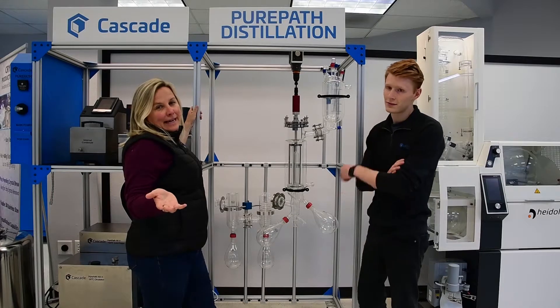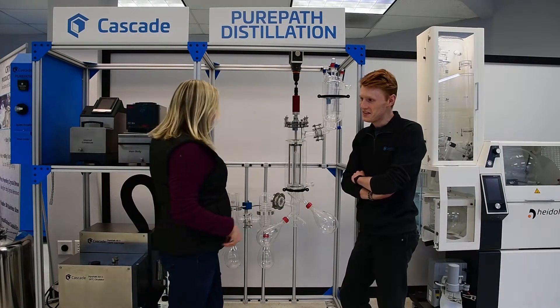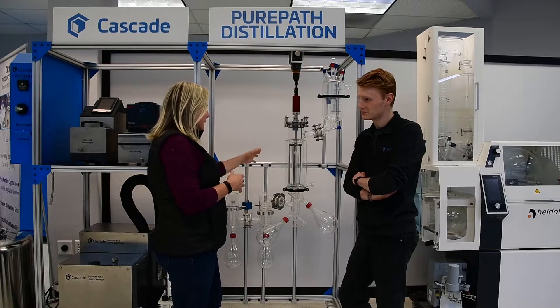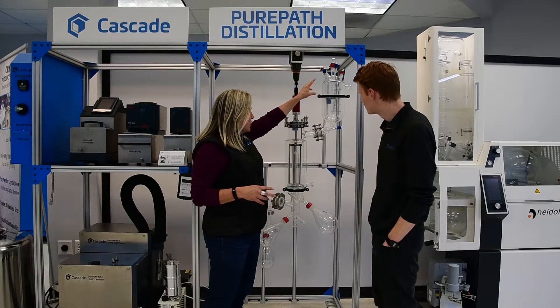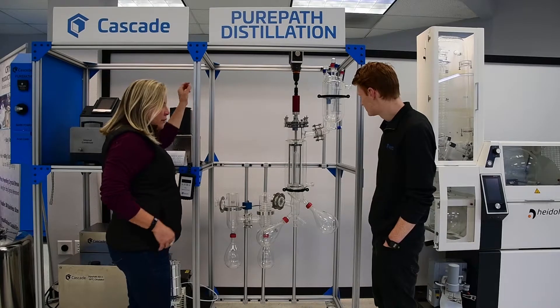I speak slang, Maxwell speaks chemistry — so we'll get through this here. And what are some of the adjustability features that you find on a system like the PurePath? It looks like we have a flow rate here, we have some vacuum adjustability, and obviously temperature control. Can you go through some of those things?